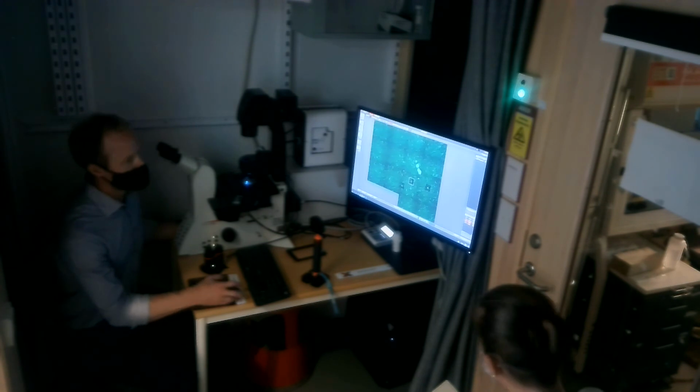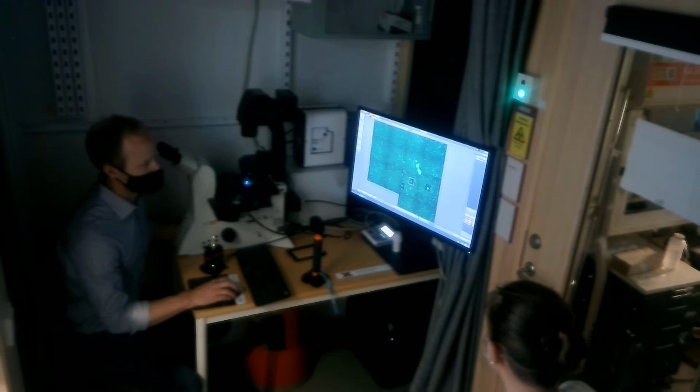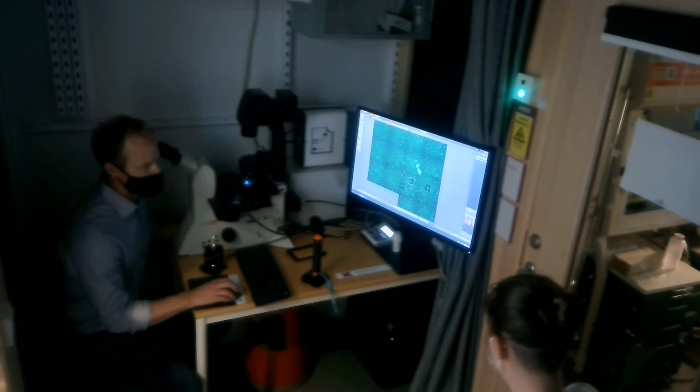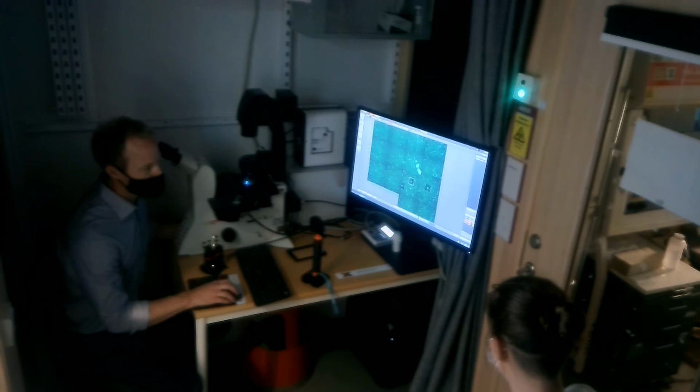So now that I put something, something to notice here. Whenever I put a marker, basically when I put a region of interest, I'm getting more things happening in my task list over here. So in the task list, they keep filling up with things that it will do, things that it will image. The first two were the ones that I had used the mark. We can see it has a little thing there, and we can see that there's a Z attached to it, whereas these ones don't have this Z attached to it.